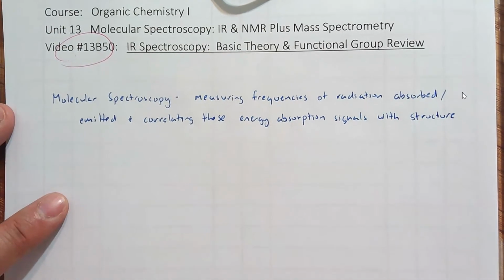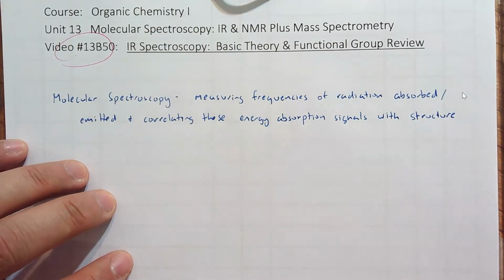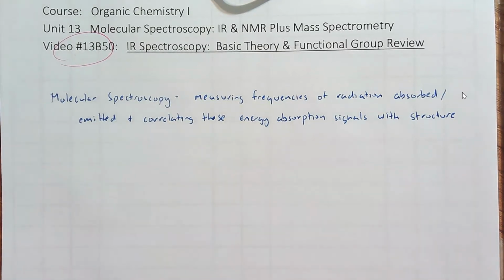Let me see if that makes sense. Measuring frequencies of radiation absorbed or emitted and correlating these energy absorption signals with structure. I like that.